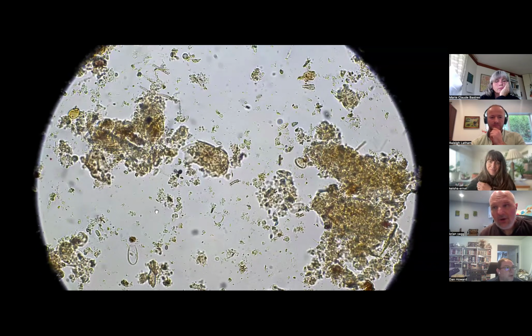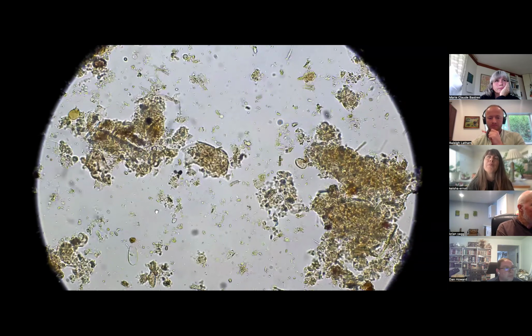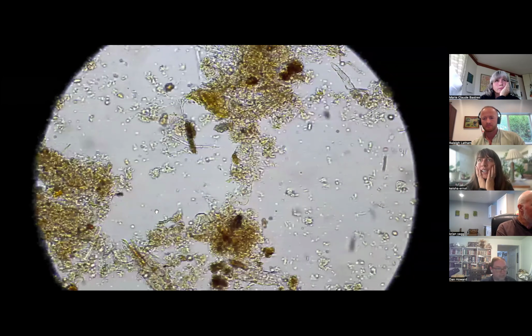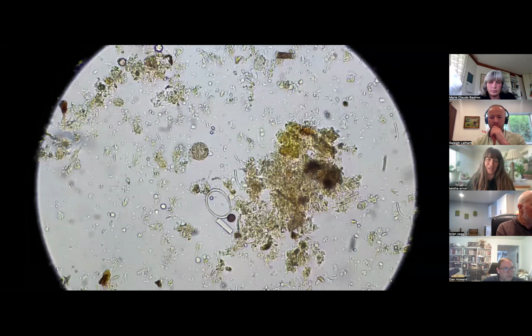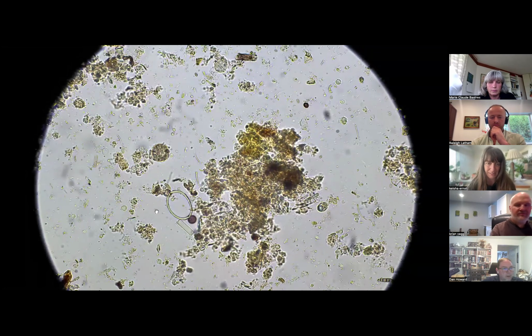Unfortunately, Rich was asking about naked amoeba earlier, and I saw one earlier in here, but sometimes they'll go into an aggregate and you'll just never see them again. Check ponds. Pond systems are a really good place to find incredible naked amoeba. And when you're at the pond, try to think soil. So get plants, some organic material, any sort of muck. If it's too much sediment, sometimes it's hard to see, but just the right kind of muck on the side of a pond will have so many naked amoeba of all shapes and sizes.